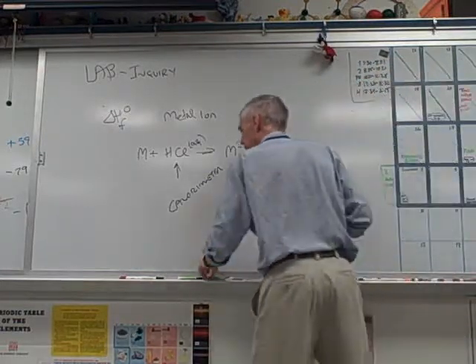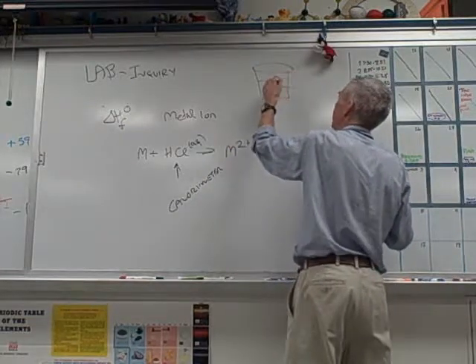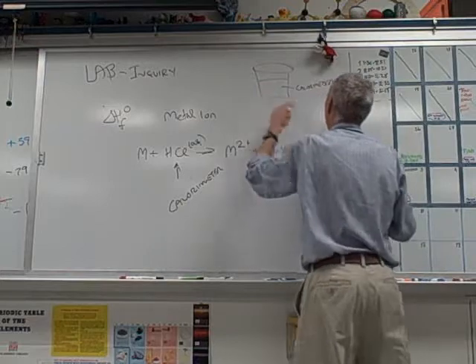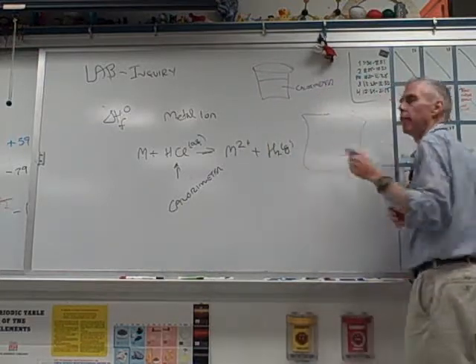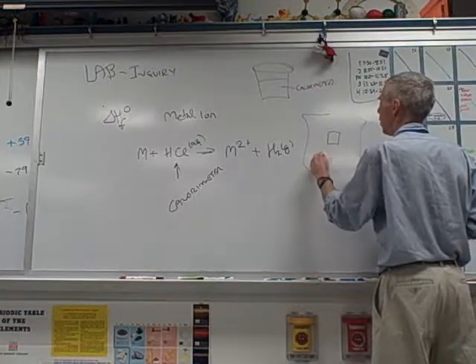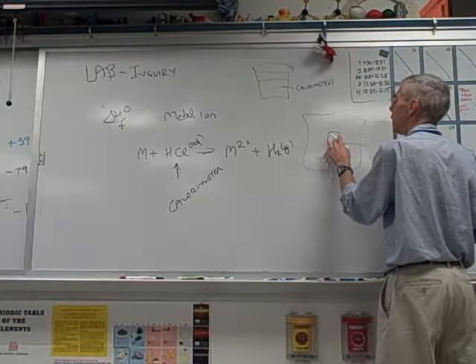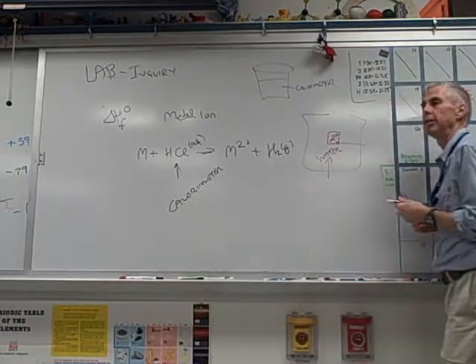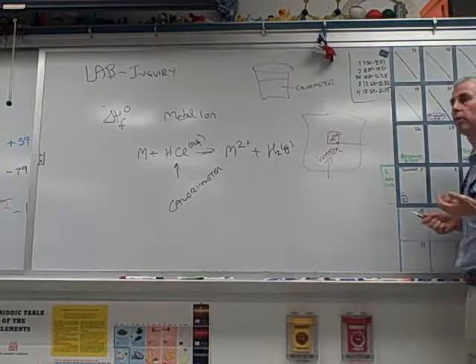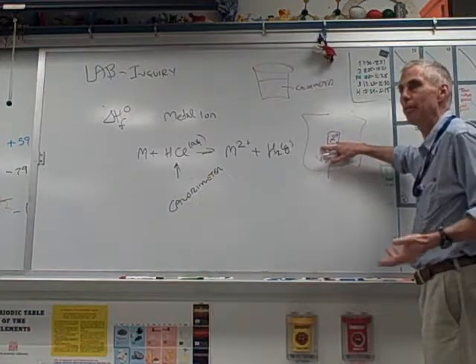Now, calorimeter. Basically, what your cup with water in it has served as is a calorimeter for the first two experiments. In reality, if you were testing, say, food, I've actually seen a bomb calorimeter that they use on food. They put the food in here. This is surrounded by lots and lots of water. They have some way of igniting it and knowing how much energy they put in to ignite it. They ignite your food and see how much energy it gives off. That's how they determine the calorie counts of foods. So it's not like they go and test it somehow. It's literally they burn it up and see how much food energy there is.